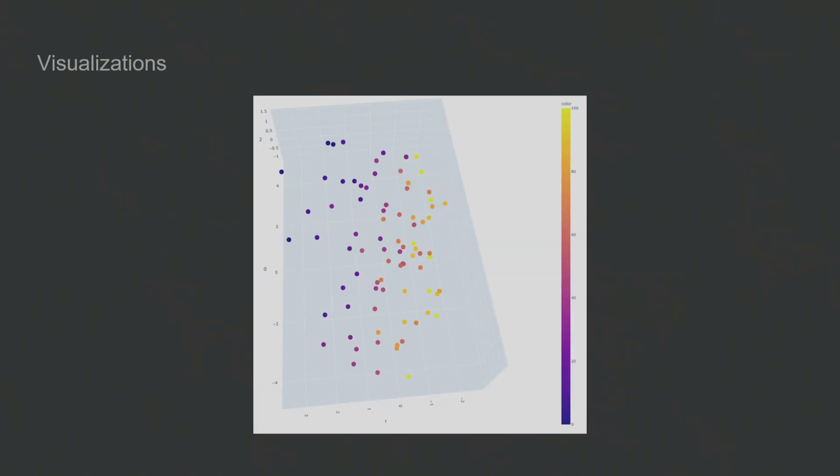And we also did one test called a mosaicity test, where they mixed patients with Klinefelter with healthy patients, like the DNA. For example, they mixed 80% of Klinefelter data with 20% of healthy patients. And we should be able to see that as something like 80% Klinefelter. And basically we see that here. These ones have 0% Klinefelter, and the more you mix it, the more they go down, which was a good sign that told us, okay, we're on a good track.